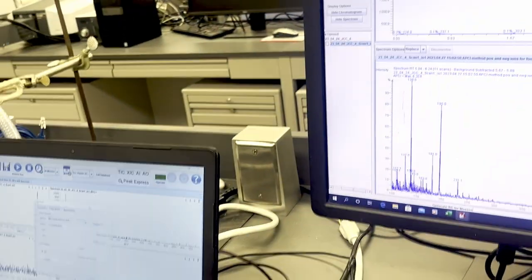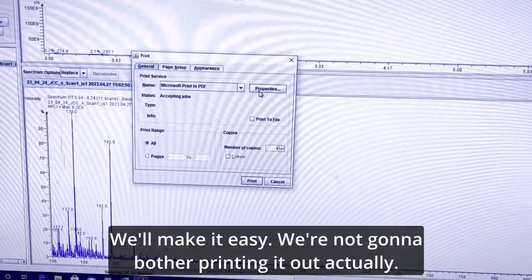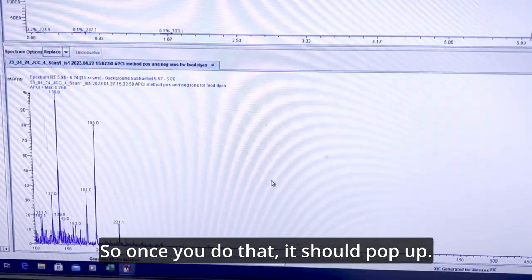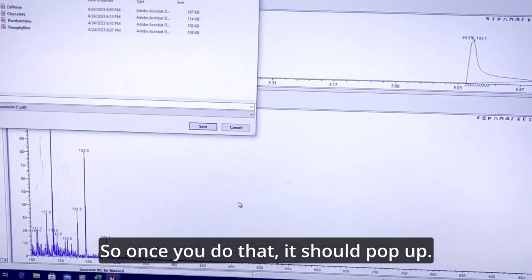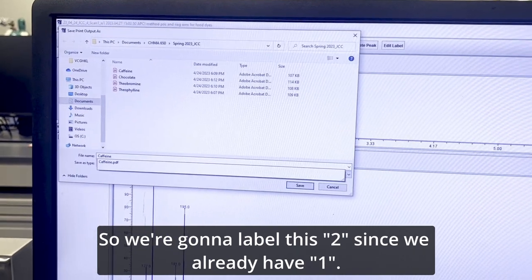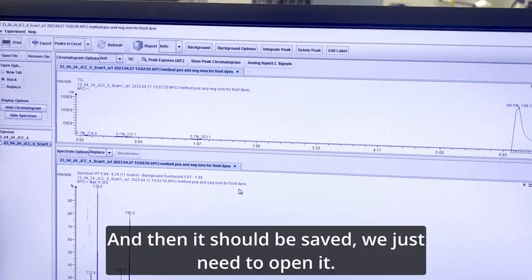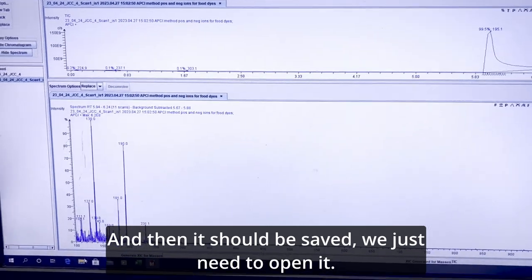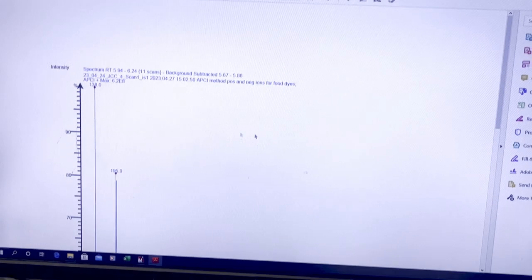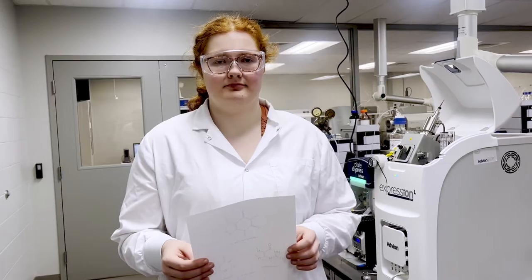So when it pulls up, is this a general printing thing? We're going to just print a PDF, make it easy. We're not going to bother printing it out actually. So once we do that, it should pop up. So we're going to leave this two since we already have one. Save. Okay. And then it should be saved. We just need to open it. Here it is. And here's our spectra.